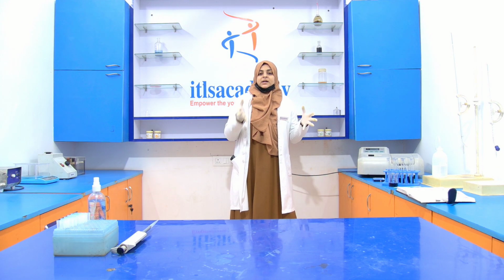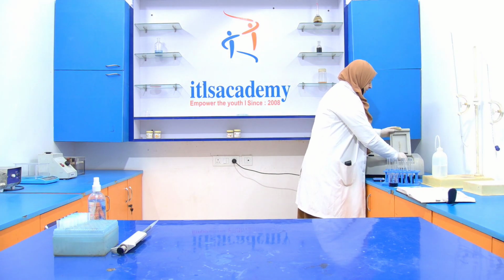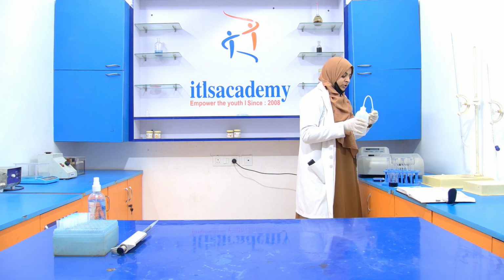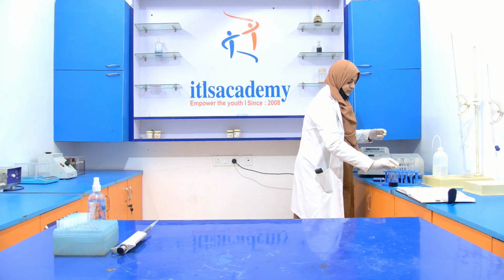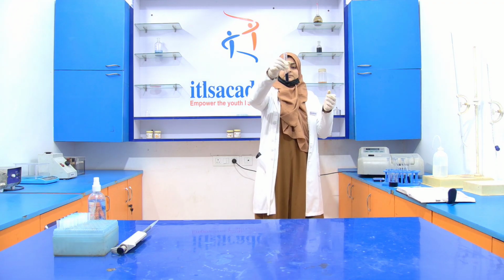Now we do all the concentrations of the BSA. We take the reading of all the concentrations of the BSA and the blank one. Now the remaining is what? The remaining is our sample. So we have to take the sample reading also. Now wash it with that distilled water. Then this is your sample.